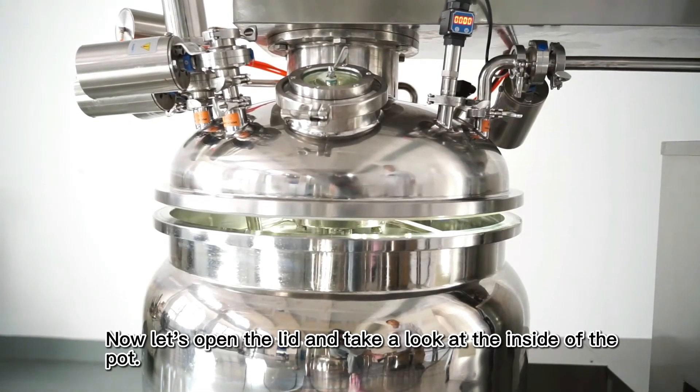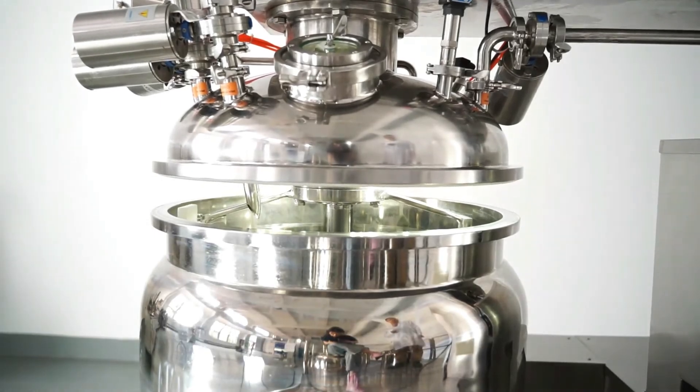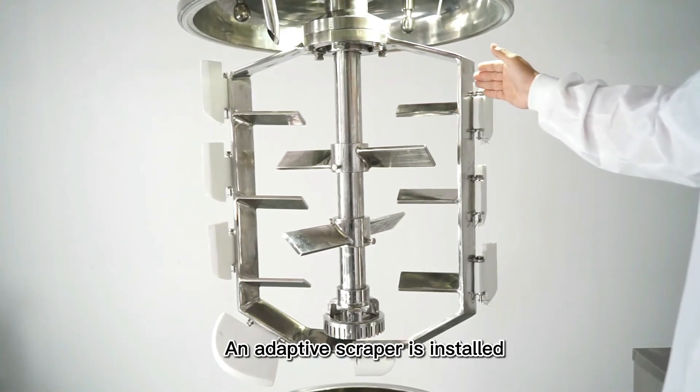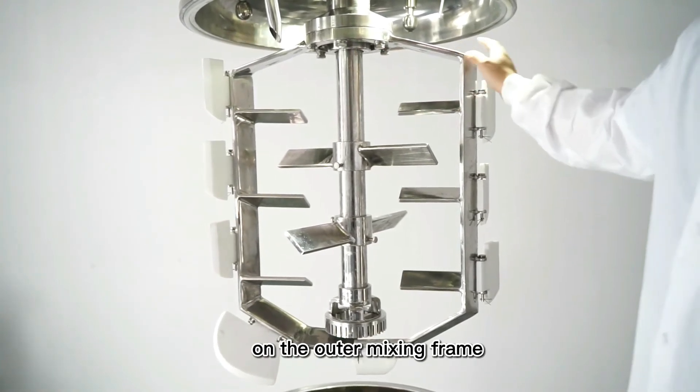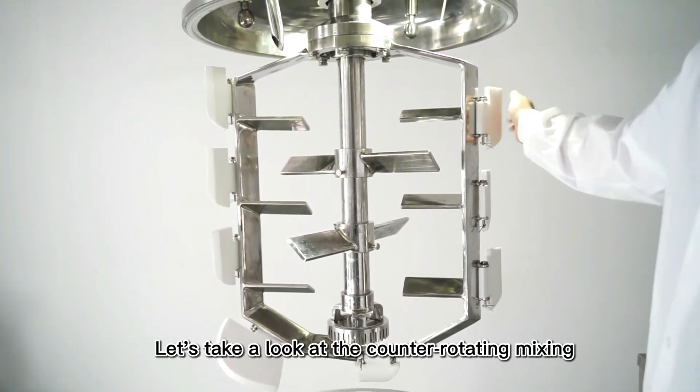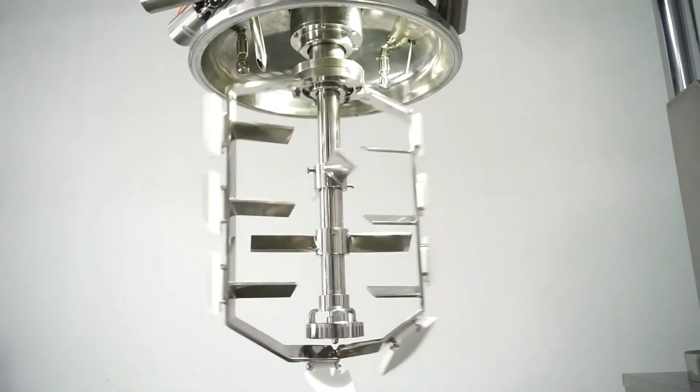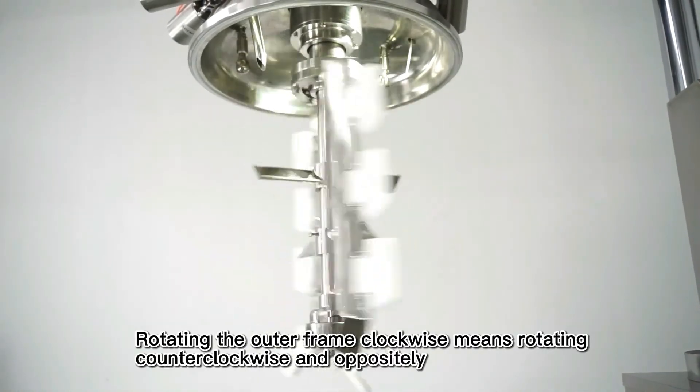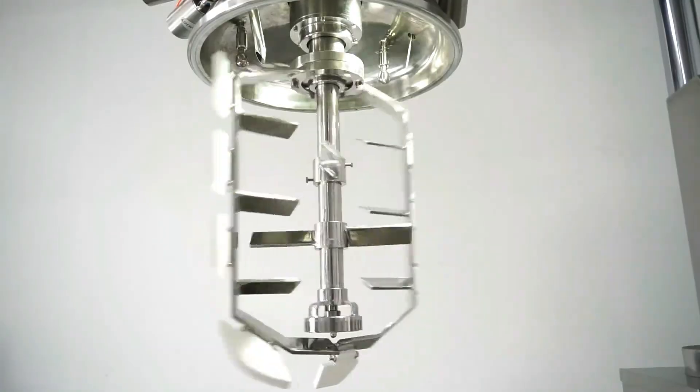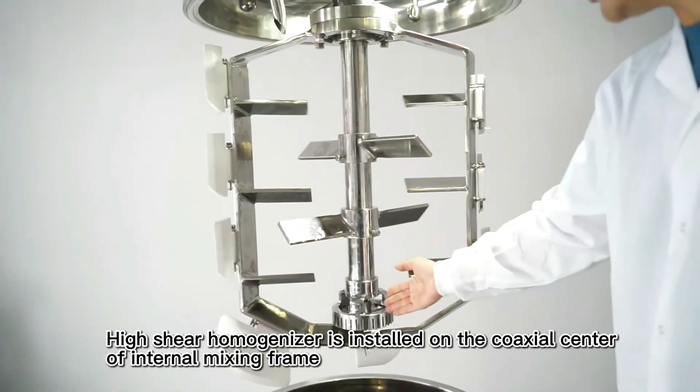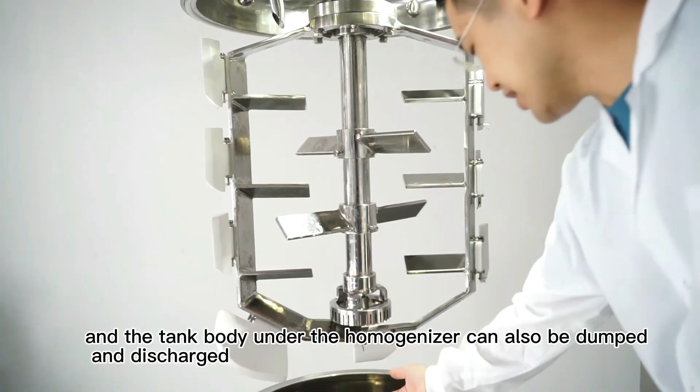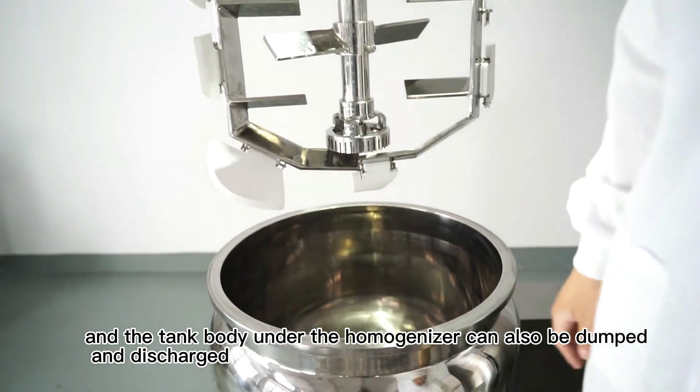Now let's open the lid and take a look at the inside of the pot. The inner mixing frame employs a counter-rotating structure. An adaptive scraper is installed on the outer mixing frame. Let's take a look at the counter-rotating mixing. Rotating the outer frame clockwise means rotating counter-clockwise and oppositely. A high shear homogenizer is installed on the coaxial center of the internal mixing frame, and the tank body under the homogenizer can also be dumped and discharged.